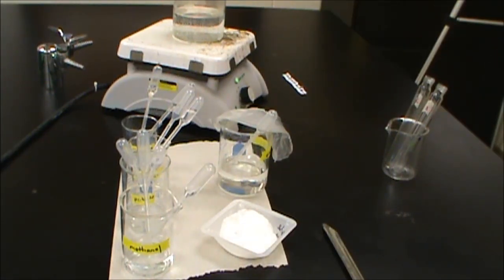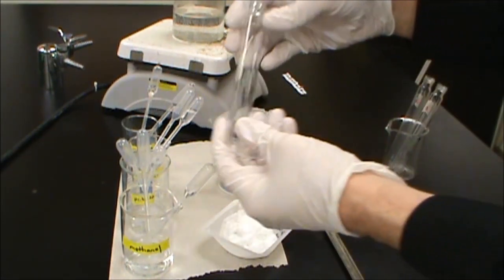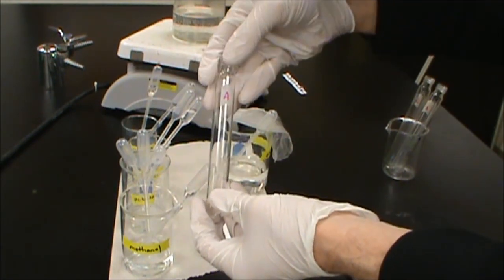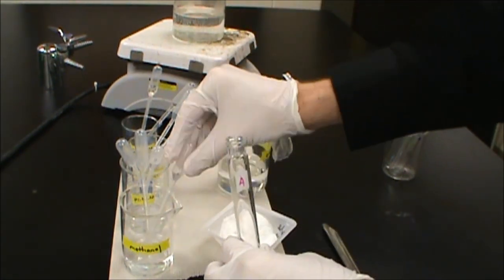We're going to go through and show you how to make three different esters. So the first one, we're going to take test tube A here, and we're going to add 10 drops of methanol to it.